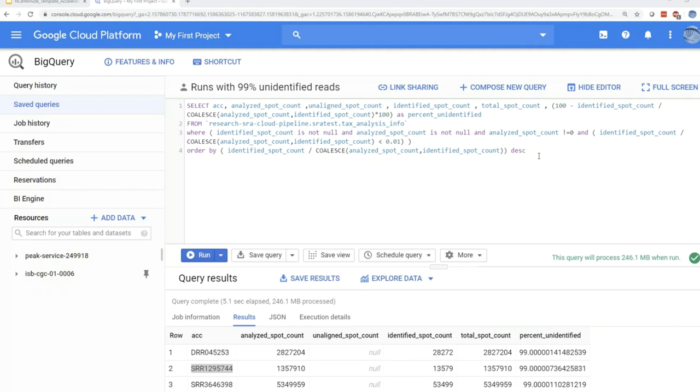And someone also asked, can you show an example of actually doing an assembly in the cloud for a particular SRR? So doing assembly in the cloud is not any different than running assembly at your local server. You use the same tools as you would there as well, and the only difference is that instead of running it at a local server that you have available to you or your desktop, you're doing it on a server that's located in the cloud.